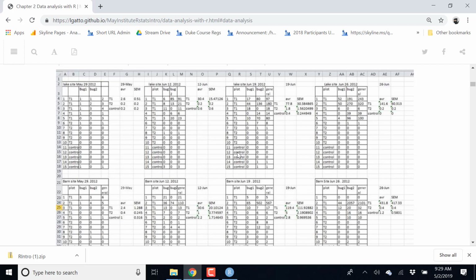So if you have a table like this, you stand no chance to read it into R, but it's true for any data analysis software. It's just not going to work. Even with advanced programming skills, you'll waste days and days and days trying to reformat it.